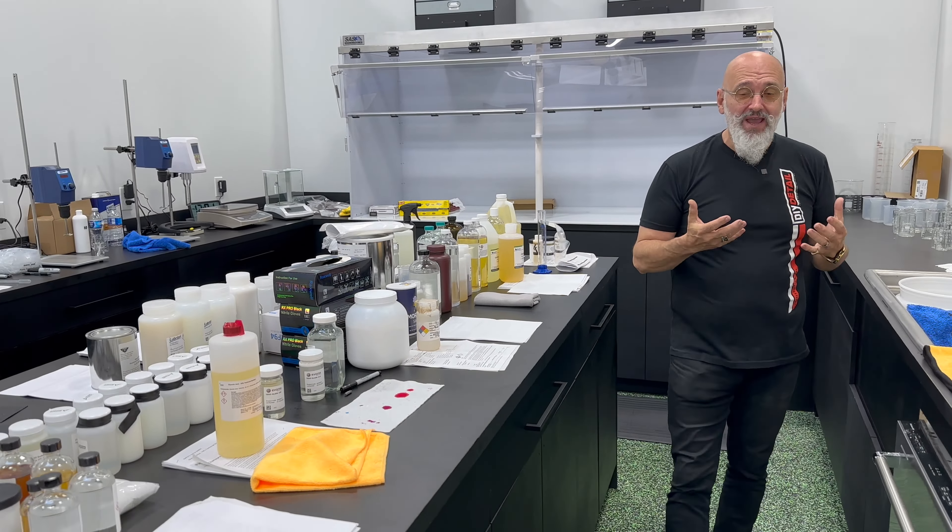This is a very interesting machine. This is to give you the contact angle of water. So when we're testing coatings, we want to know that contact angle. This is how it works. Camera here, the drop of water comes out there, the back there, and it tells us the actual contact angle. We can see it. It's a lot of fun. And that's how we can determine exact contact angles. That's the machine to do it.